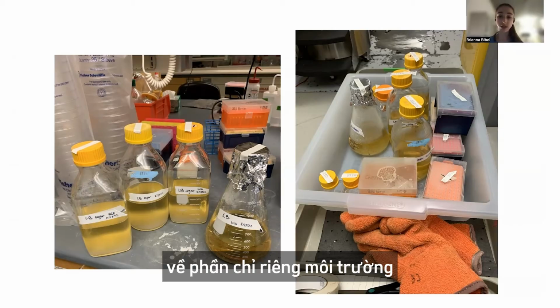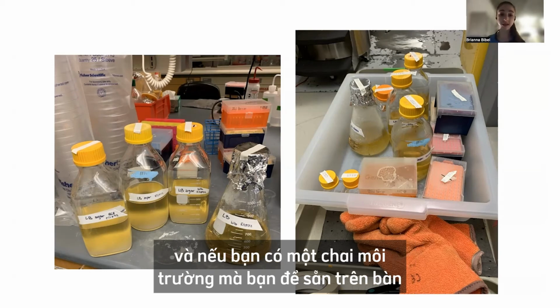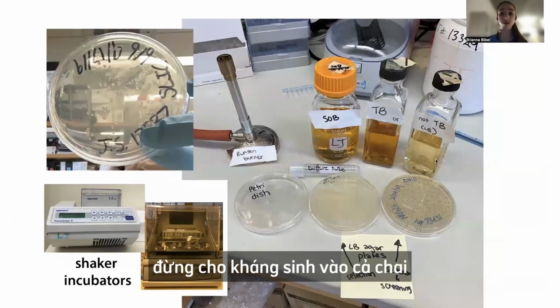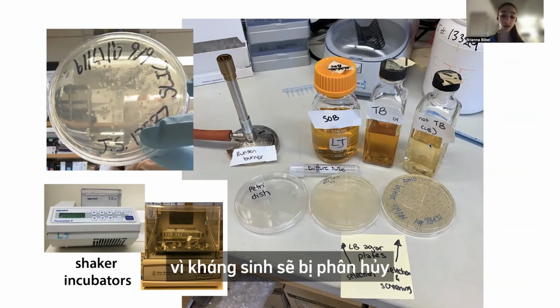In terms of just the media, when you're keeping that media out on your shelf or you're waiting till the next day to use it, you don't want to add the antibiotic until you're ready to use it. And if you have a bottle of the media that you keep on your bench and take portions of, don't put the antibiotic into the bottle. When you take a portion of it, then add the antibiotic to that portion, rather than try to keep this media with the antibiotic in it over time, because that antibiotic will degrade and then it won't be useful.